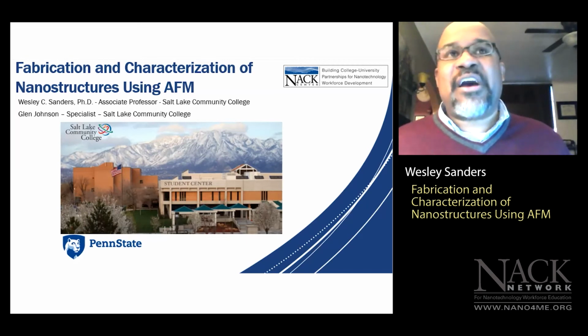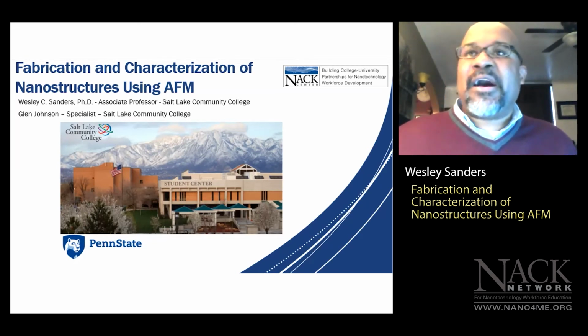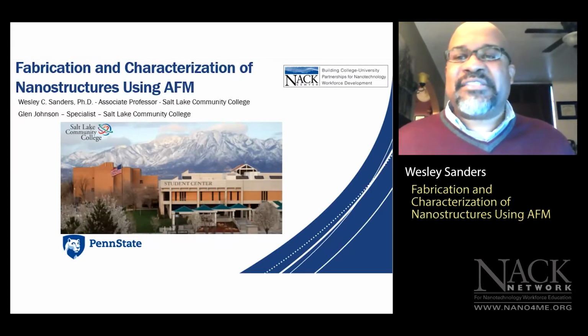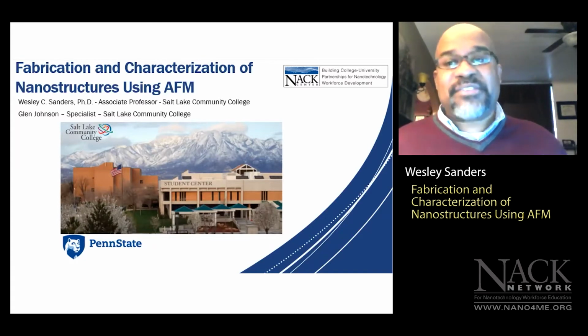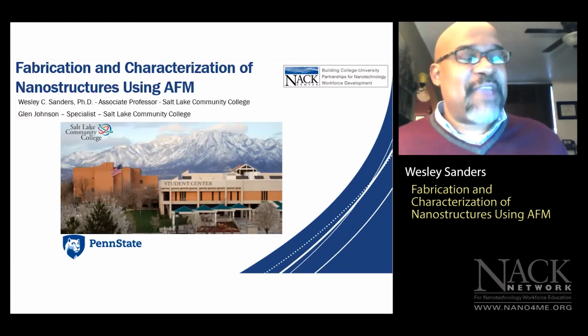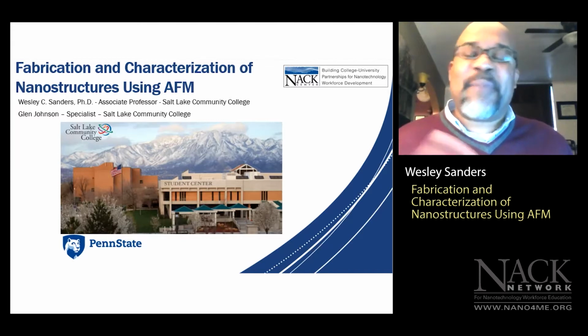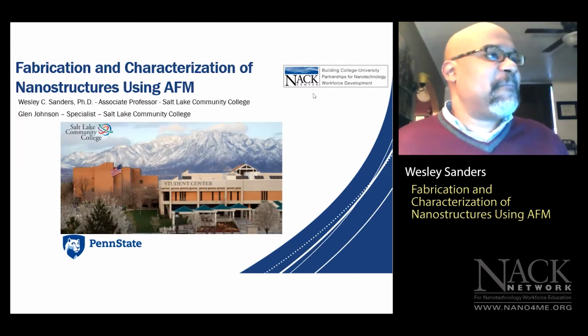You use this ultramicroelectrode to scan sample surfaces using redox current, because this technique was performed in an electrolyte. But it wasn't until my postdoctoral work at the Naval Research Lab that I learned how to use the atomic force microscope, which again is one of many flavors of SPM, or scanning probe microscopy.